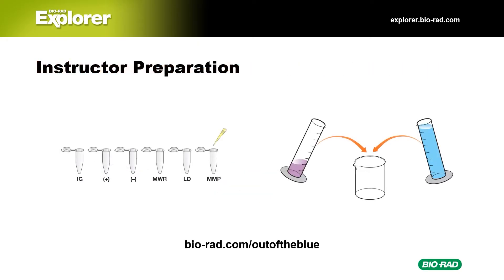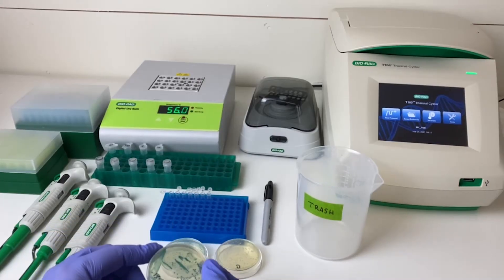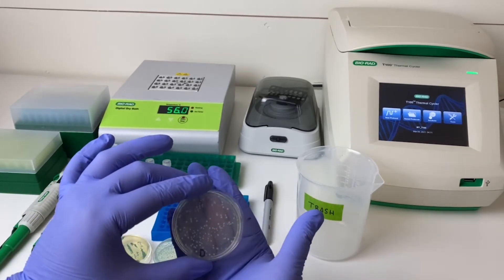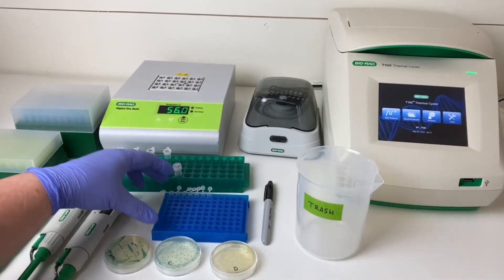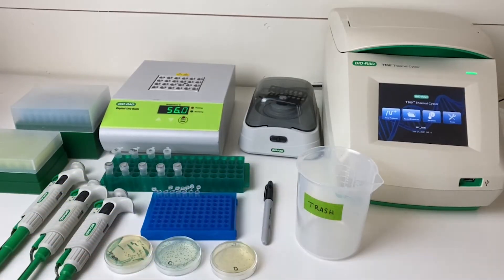Instructor prep for this lab is fairly straightforward. You'll aliquot the InstaGene, controls, marker, loading dye, master mix, and primers, and you'll also need to prepare gels and electrophoresis buffer. For the first day of the lab, you'll need your bacterial plates from the gene editing lab: a starter plate, plate C with blue colonies, and plate D with white colonies. You'll also need a rack with tubes containing InstaGene, master mix plus primers, positive and negative controls, and five empty screw-cap tubes. You'll need a PCR tube rack with seven empty PCR tubes, a permanent marker, a cup for trash, three micropipettes (P20, P200, P1000) and tips, two dry baths or water baths set to 56 and 95 degrees Celsius, a centrifuge, and a thermal cycler—today we're using the Bio-Rad T100.